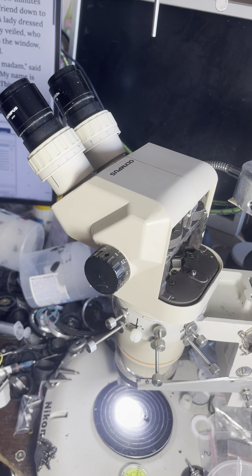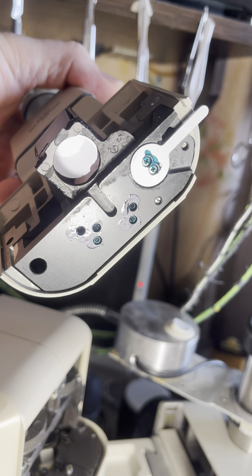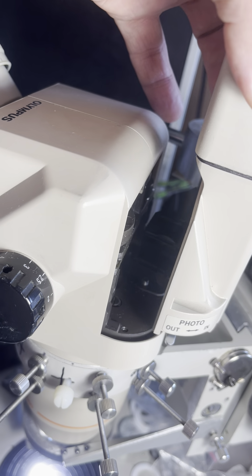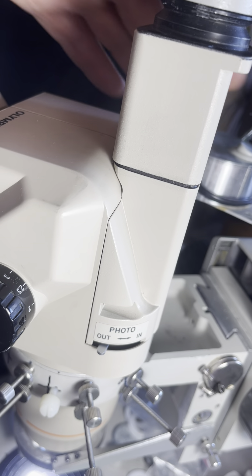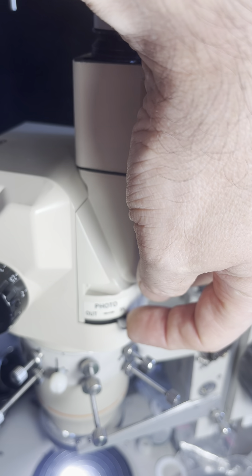To attach this photo splitter, we need to turn this lever into the correct position. After that, we need to place this cut over the head of the screw and put it inside.